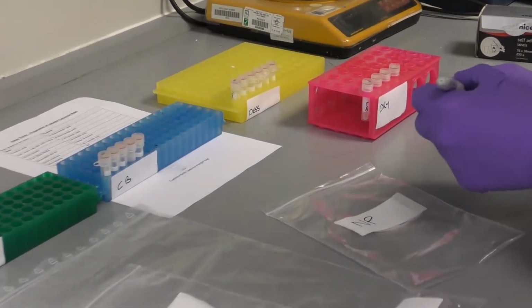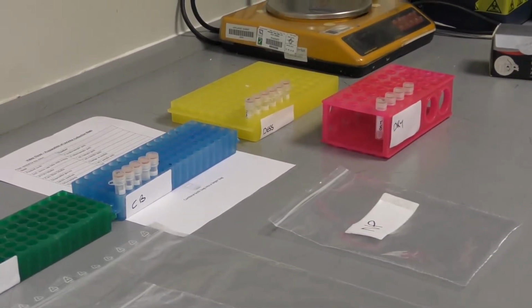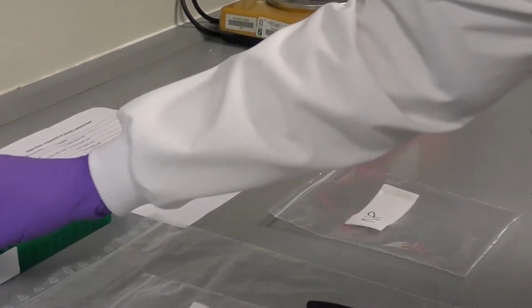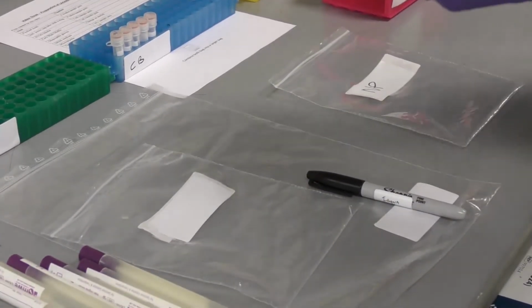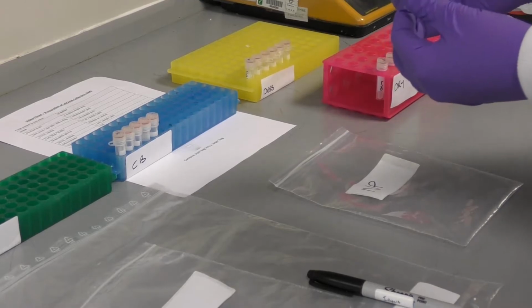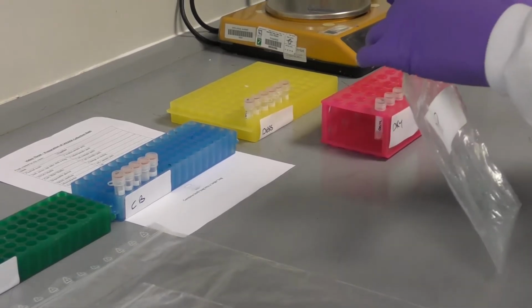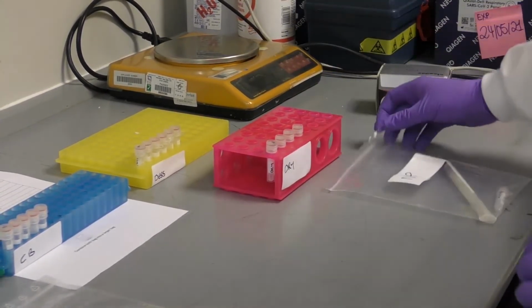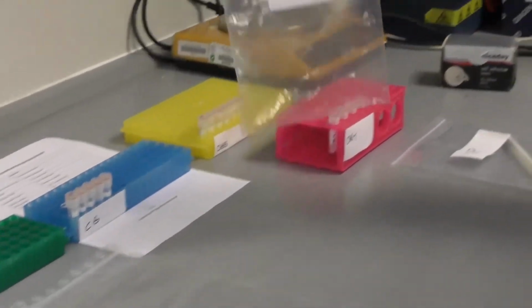The first pack we are going to assemble is a nasopharyngeal pack. Place a blank sticker on a plastic sample bag and label it with the letters NP for nasopharyngeal. You will need to add a linked barcode for the collection packs to all of your vials that you're going to include. If you have pre-labelled and pre-aliquoted your collection vials, you can add your checked STGG tube and a nasopharyngeal copan swab 553C or 503CS01 into the NP plastic bag and close.